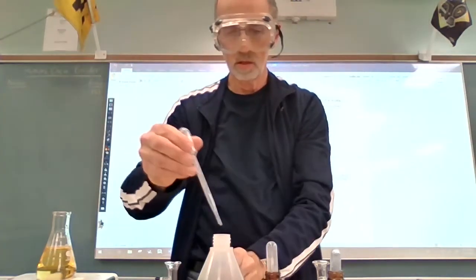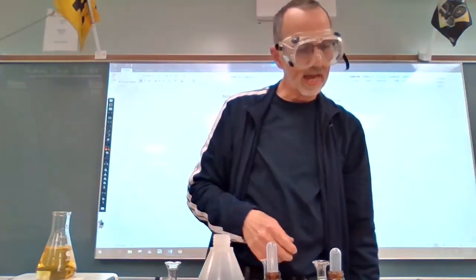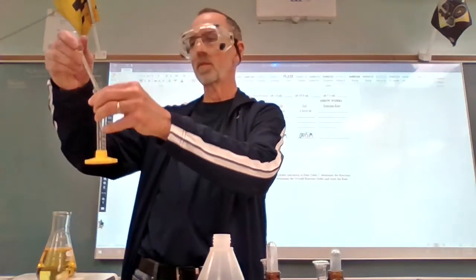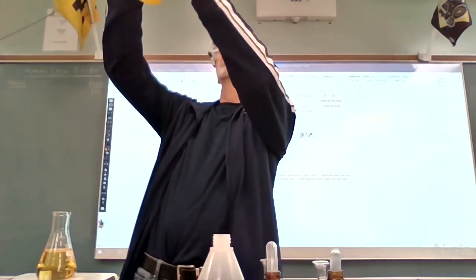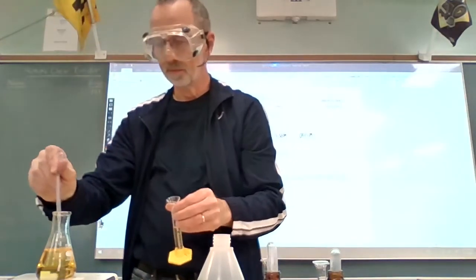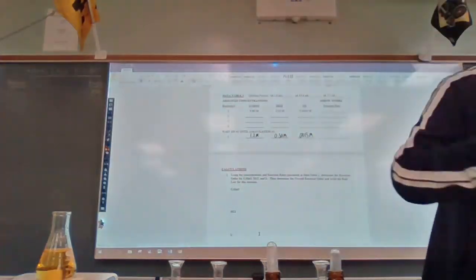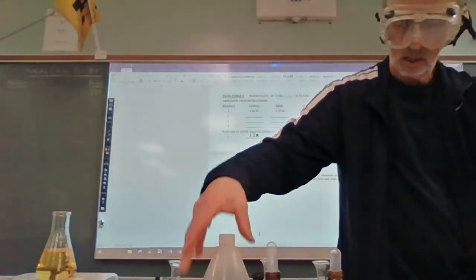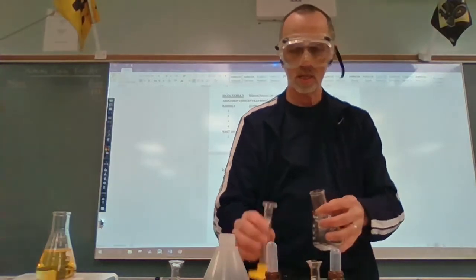There we go. And 7.5 of iodine. There we go. Okay. Rinse this out real quick. Put in my first 3 reactants.